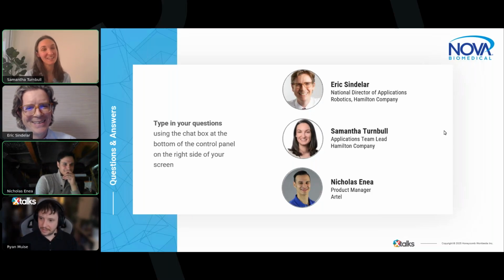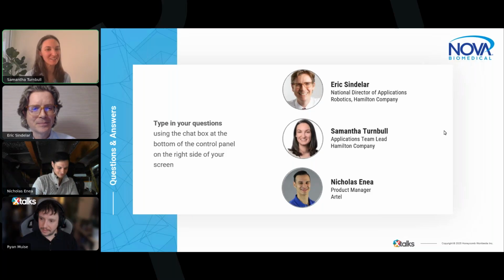Sure. Hamilton has a lot of great resources on our website. We have some training resources. There's definitely that handout that we've attached, which has some liquid handling references, really describing those modes and parameters. But it's really about understanding your platform, what automated liquid handler you're using, and what is important to that platform.